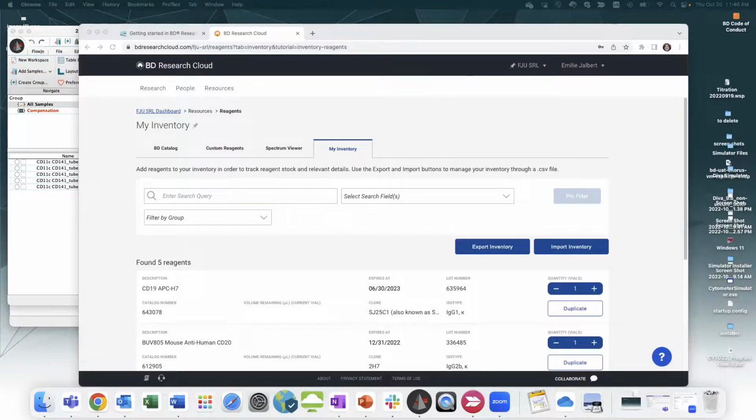Okay, let's see. Can you name and rename specimens and tubes within BDRC? There is no spectral functionality at this point, but BDRC will have regular releases, so we hope that that's a new feature that we'll include.